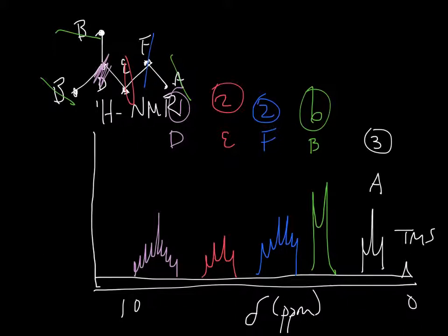They pop off and they exchange with the water or the other alcohols around. We've already seen that when we were doing arrow pushing before. You'd seen the alcohol or the water would go and grab a hydrogen and it would lose a hydrogen. It just constantly does it. So it doesn't stick around long enough for it to split because it leaves. And especially carboxylic acids, the pH, because those are acidic hydrogens, so they pop off all the time.